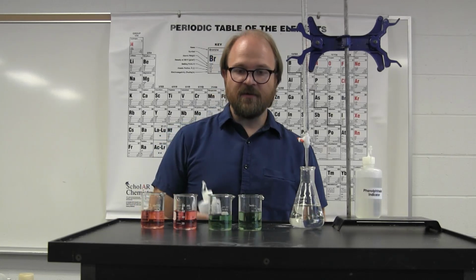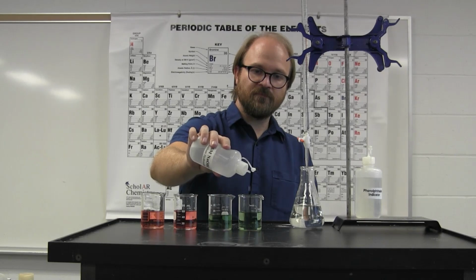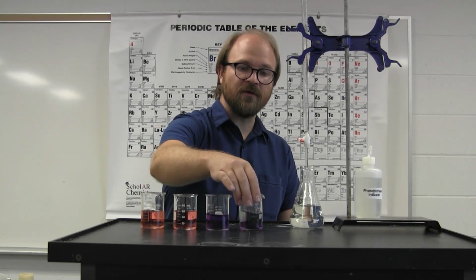Or if I add a small amount of base, the solution will turn a purple color.